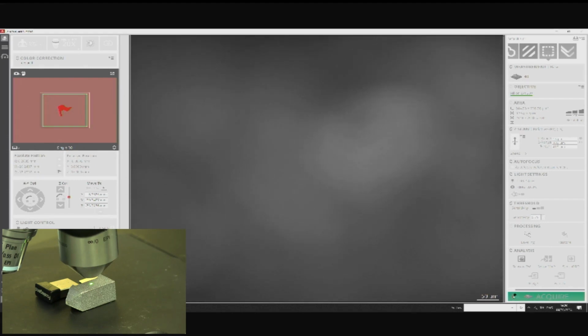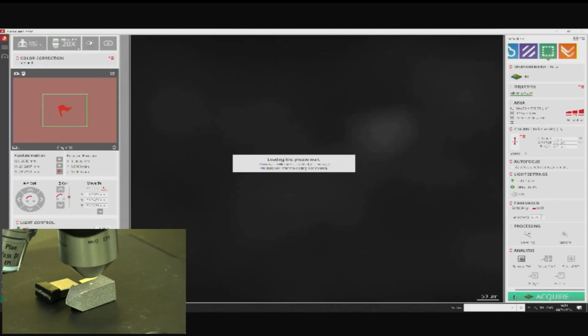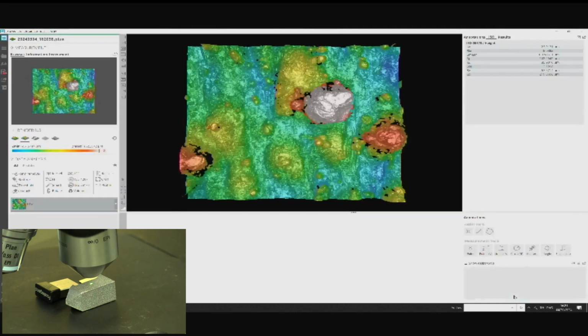We've taken 417 planes over a 415 micron area, so we're effectively taking one plane every micron. From this data set, we should see a nice textured point cloud that we'd be able to depict those step heights or those roughnesses. Now, focus variation and confocal, depending on the specifics of the roughness, we're using for a lot of clients that we have within the additive sector.